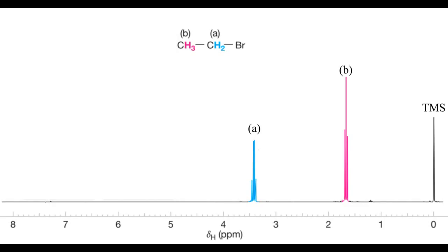Finally, use the integration values to determine the relative number of protons in each environment. This step is crucial for matching your HNMR data to the molecular formula. Let's look at some examples to apply what we've learned.